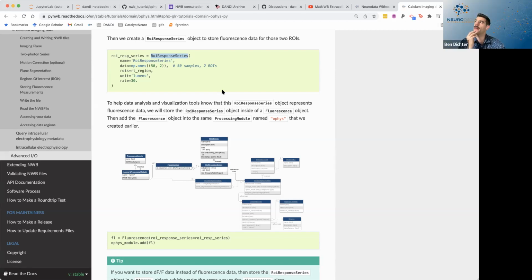Yeah, I guess it depends. It's pretty common for people to have multi-plane imaging where they're switching so fast between the planes that they're basically doing volumetric imaging. Is it that kind of thing, or is it like 5 seconds of this layer and 5 seconds of this layer? No, it's very fast.